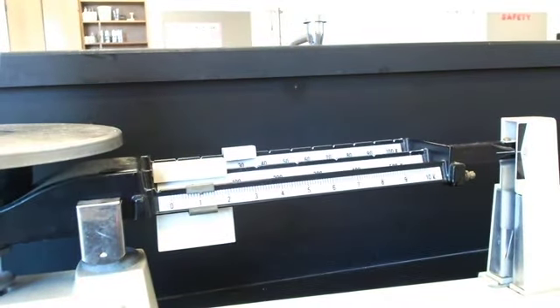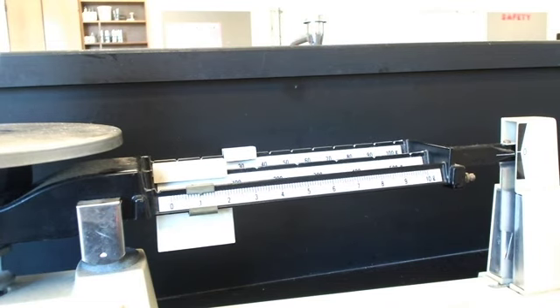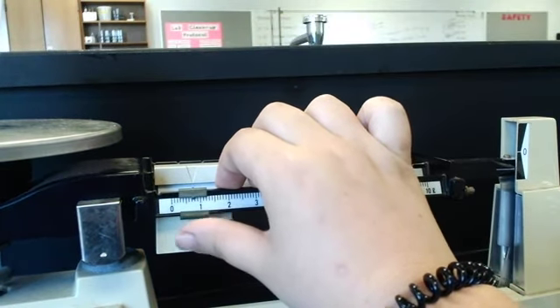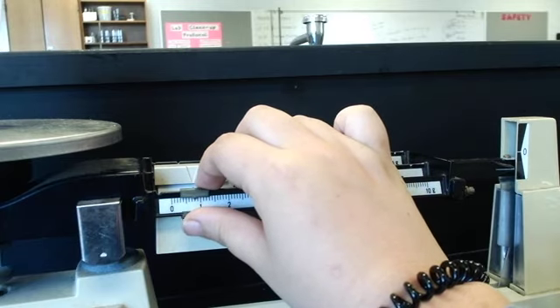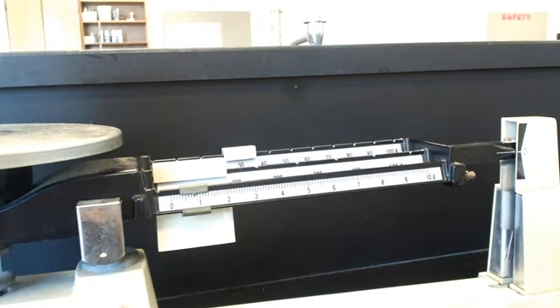All right. So this is the mass of the large beads. It's close. Let's see here. Put it here. Okay, I'm going to say I'm pretty satisfied with that at about 30.80.